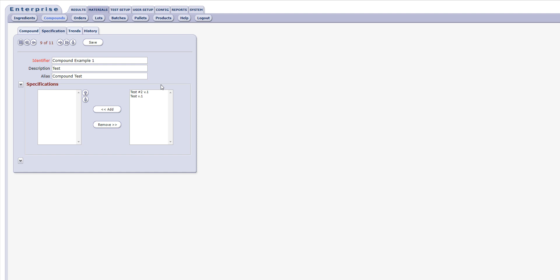Of note is that you may want to create the specification for a compound prior to creating the compound record to allow the spec to be assigned during compound creation. Specifications may be created under the Test Setup tab in Online Manager.